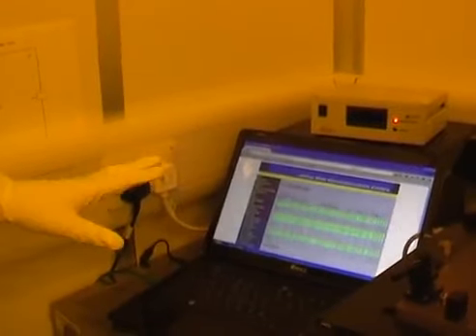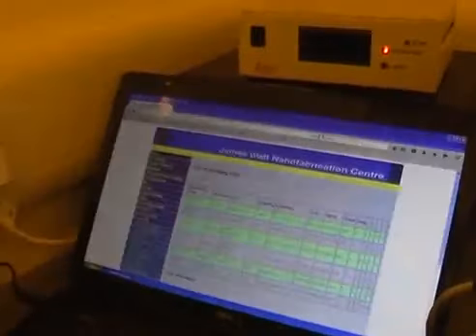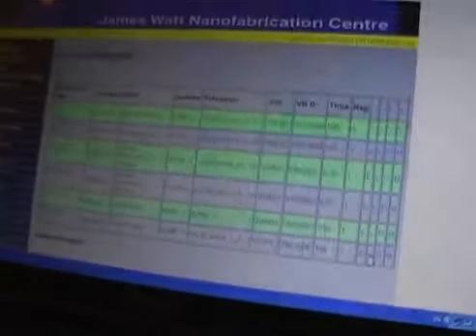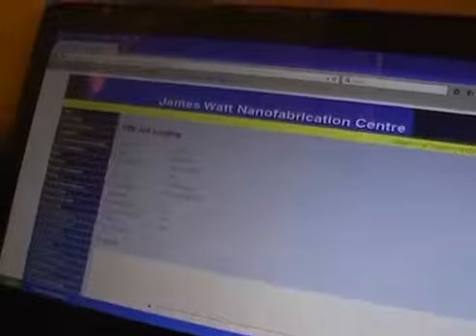Okay, so the first job is to look closely at the job details here and make sure that when we load it, we do so correctly and in accordance with the user instructions. So here's the job in question, this one at the bottom, and I can click on the L icon here for load. Oops, I click correctly, and it gives me, for instance, the thickness is 800 microns.